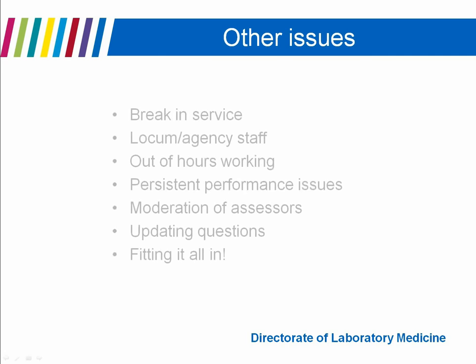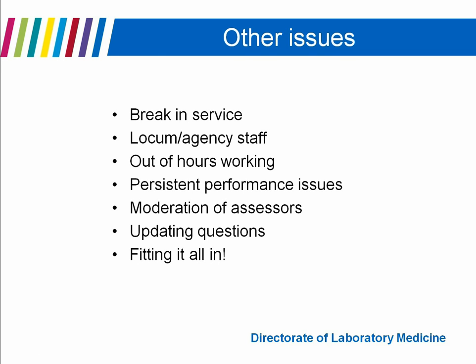Just a few other issues. Break in service, how long does that have to be before we undertake a full competence assessment? What do we do with locum staff? We have to competency assess locums. Out of hours working, how do we cover out of hours working, for example? When does a perceived issue with competence become a persistent performance management issue? And how do we moderate assessors to ensure consistency between assessors if they're assessing more than one competency?